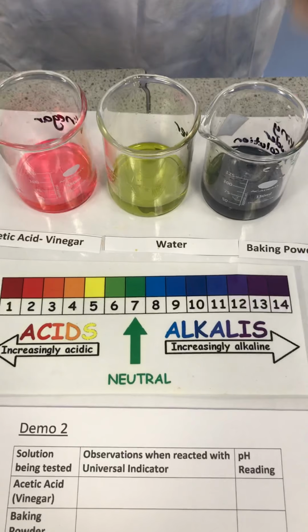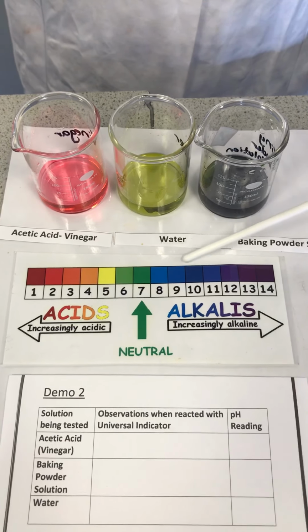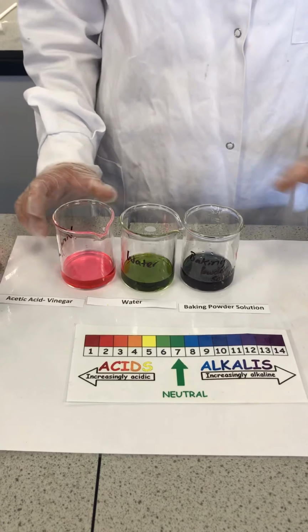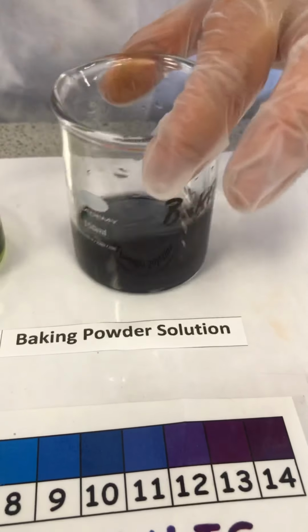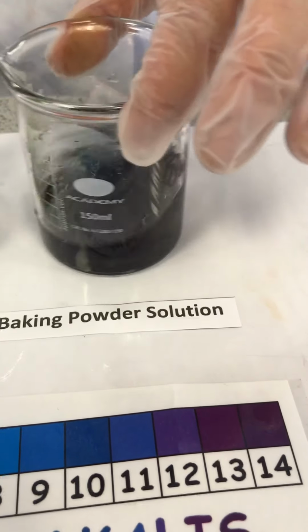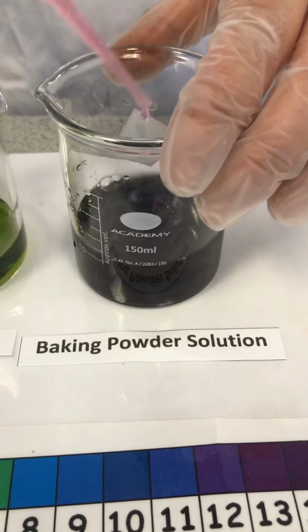What is the pH of each solution? You can guess by looking at the pH chart. Now we will slowly add the acid into our alkali solution and see the color change, till the acid has neutralized the alkali solution and the color becomes green.